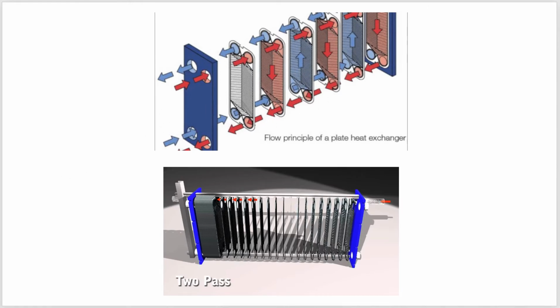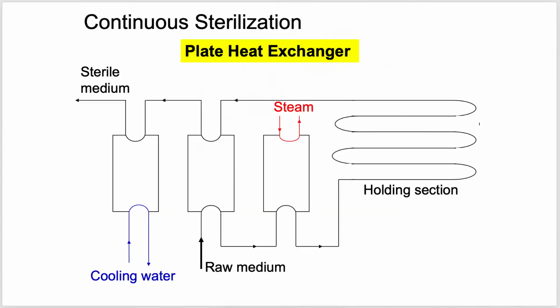And this is the flow chart of the plate heat exchanger, I mean the flow chart of the events that occur in the plate heat exchanger.